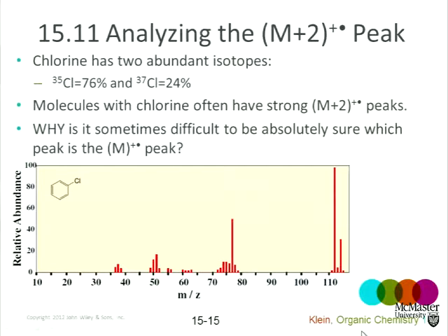So molecules with chlorine often have a very characteristic distribution of mass to charge peaks. Here's chlorobenzene. Okay? Lots of fragment ions, but if we look at the molecular ion, there's a mass peak at 112. That's the molecules that contain chlorine-35, 3/4 of all chlorine. And then a smaller peak, not at 113, but actually at 114, 2 mass units away. So this sort of pattern, 3 times the intensity to 1, differing by 2 mass units, is strongly indicative of a molecule that contains chlorine.